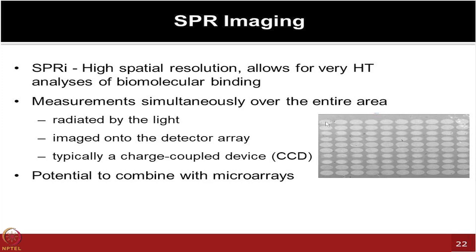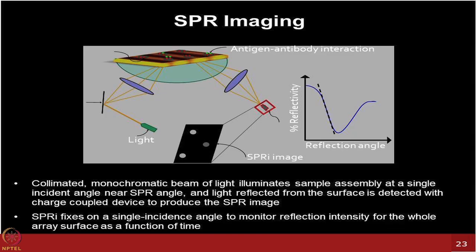So, this is one of the images I am showing from one of the experiments I was doing in Josh lab earlier when we were developing an SPR imaging based platform on the early prototypes. So, as I mentioned to you, you are seeing just the pseudo image, it is not the actual image, you are not measuring fluorescence. These are some of the pseudo images obtained from this kind of platform which shows you compatibility with SPR imaging.